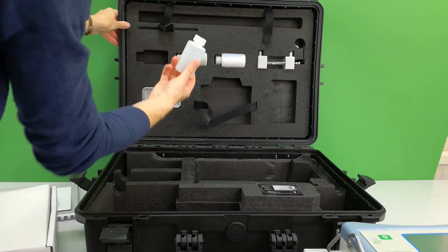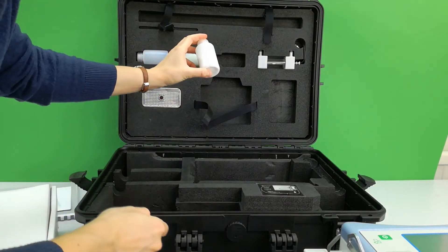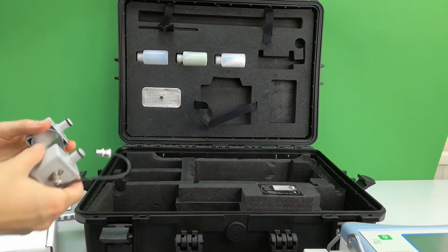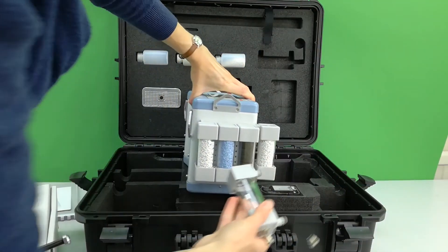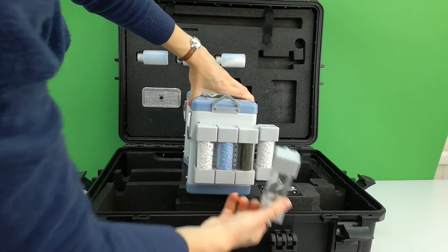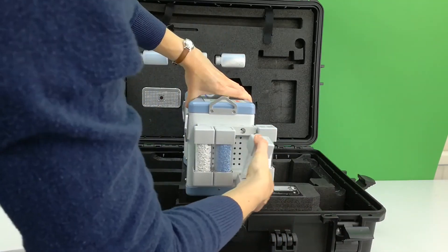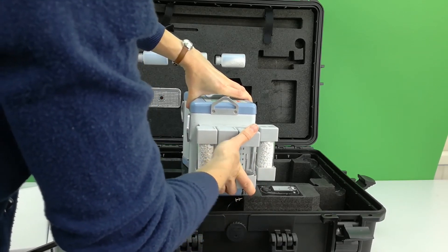Spare sample bottles are provided to fill with soda lime, dry right, and iron sulphate. An alternative humidifying chemical column is provided, which can be swapped out with the empty buffer volume. Simply clip in the chamber column once it is filled with the humidifying chemical provided.